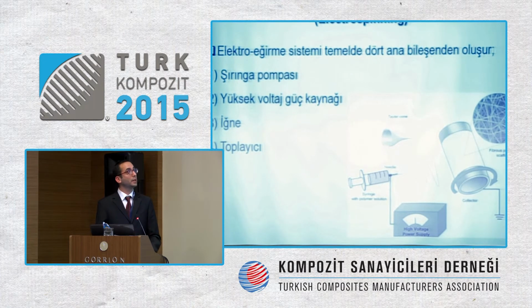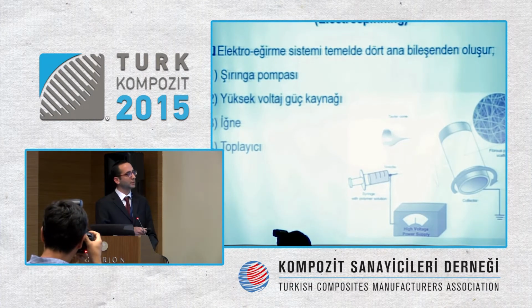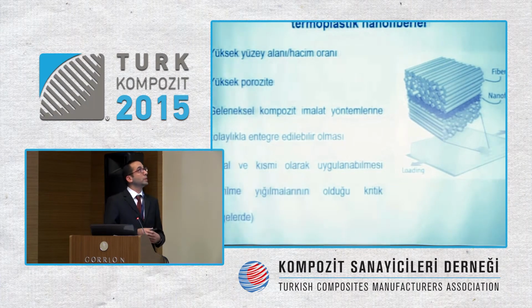And the method that we used in this study, before going into that, let me talk briefly about electrospinning. This is a simple electrospinning system. One syringe pump feeds the solution continuously. There is a high voltage power source, the needle, and the collector. As the voltage goes higher, the solution forms a Taylor cone structure after a certain voltage. Then it creates a jet, and during the flight, the solvent evaporates, and we create the nanofibers over the collector.